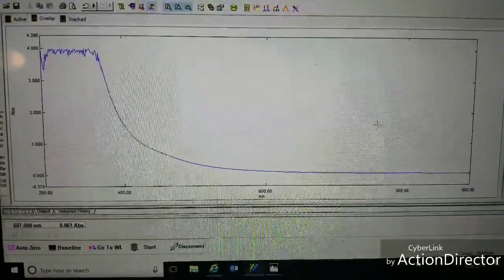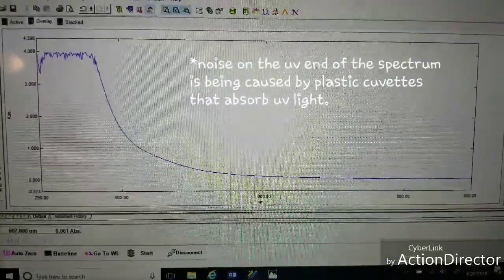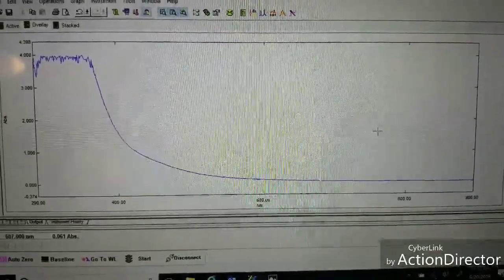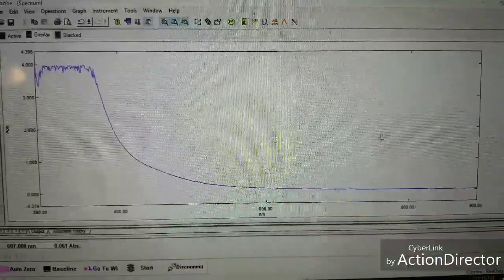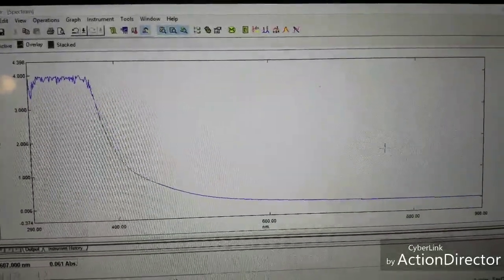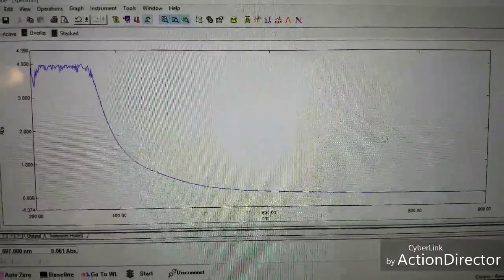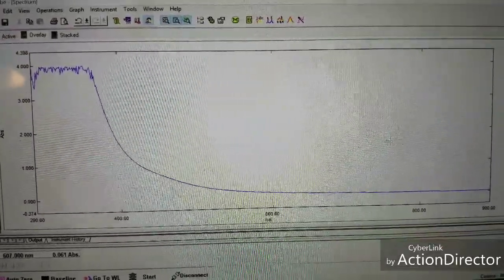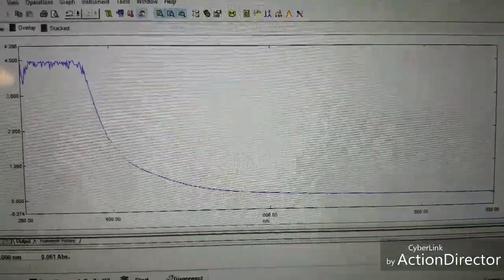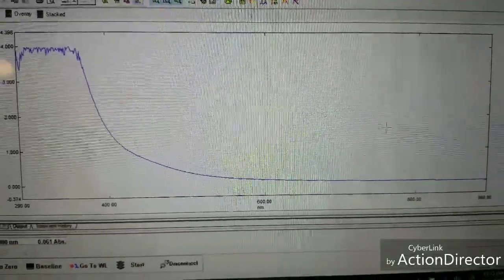Spectrum of the beer, and as you can see, this is showing you absorbance based on wavelength, and you can see as it gets to about 500 nanometers, it starts to absorb a lot until it maxes out. And that is right around where the greens and the blues start coming in, so that's why you're seeing that yellow color, because the yellow up here and the red are not being absorbed. So what I'm going to do is take one of these wavelengths, one where the second derivative is pretty much zero, which means the curve is flat. That way there's not a lot of room for error, probably around 600 nanometers. And then I'm going to show you guys Beer's Law.